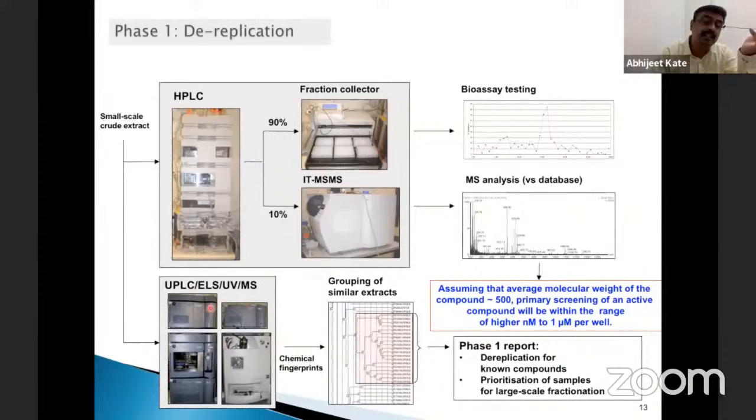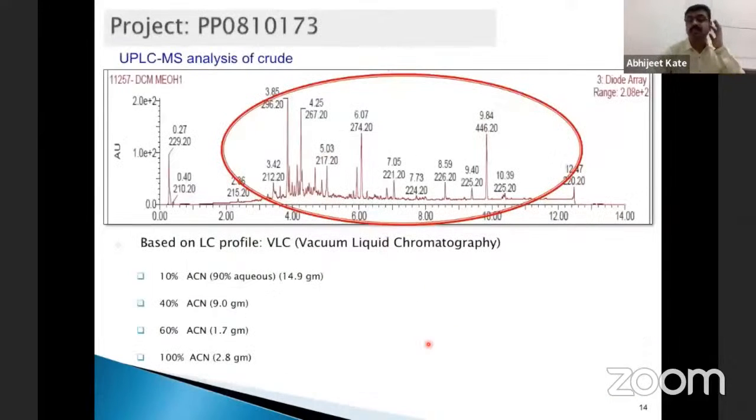We had different detectors here, like ELSD, and we had a mass detector connected to the HPLC. So all the information about that particular sample we used to get immediately with the analysis. That is how things used to be carried out. If you want to speed things up, you want to focus on the project, which most of the time will end up with an NCE, or what we call new chemical entity drug discovery.